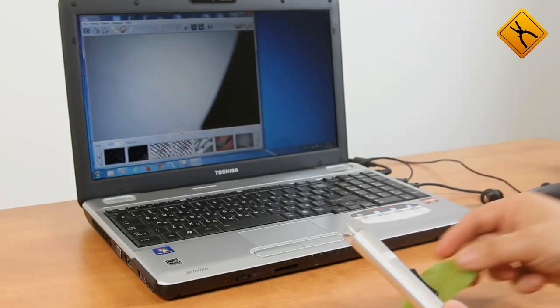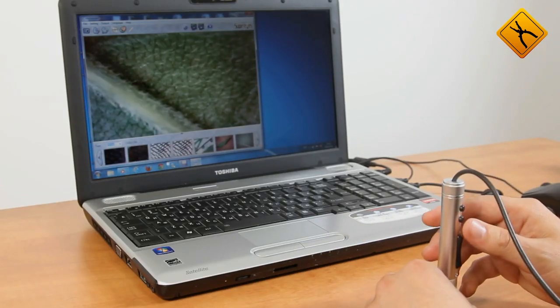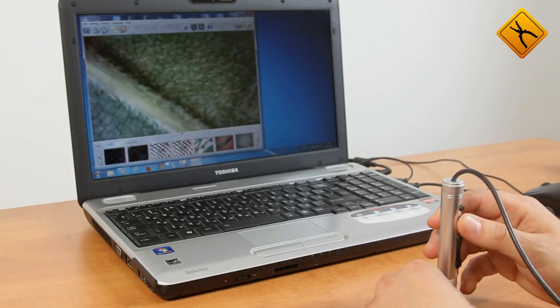Let's now remove the microscope from the stand and take a few pictures of a leaf. Press the button and the photo is ready.